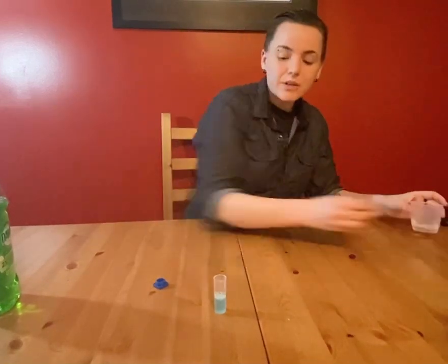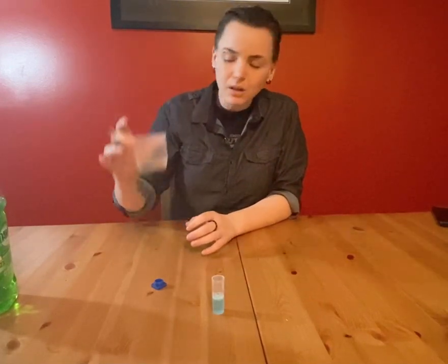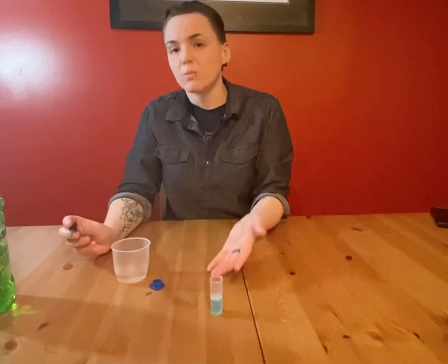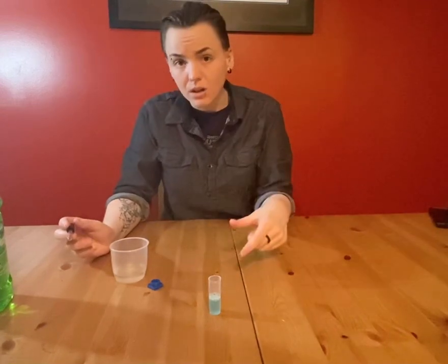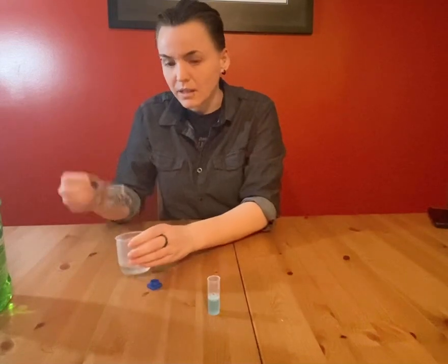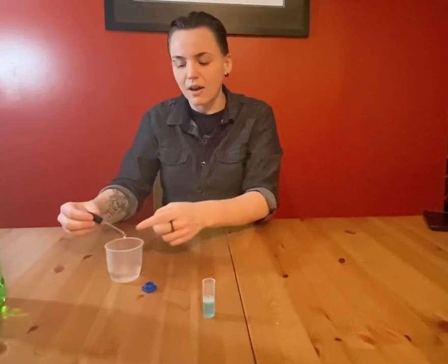So now the next thing that you do is you actually need to take rubbing alcohol. DNA dissolves in water, but it is insoluble in alcohol, which means that it will actually turn into a solid when you introduce alcohol into the solution. So you're going to take the little pipette that I supplied you, and this I actually put in the freezer.